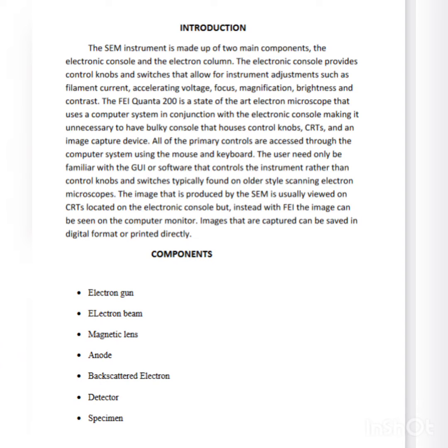with the electronic console, making it unnecessary to have a bulky console that houses control knobs, CRTs, and an image capture device. All the primary controls are accessed through the computer system using the mouse and keyboard. The user need only be familiar with the GUI or software that controls the instrument rather than control knobs and switches typically found on older style scanning electron microscopes.